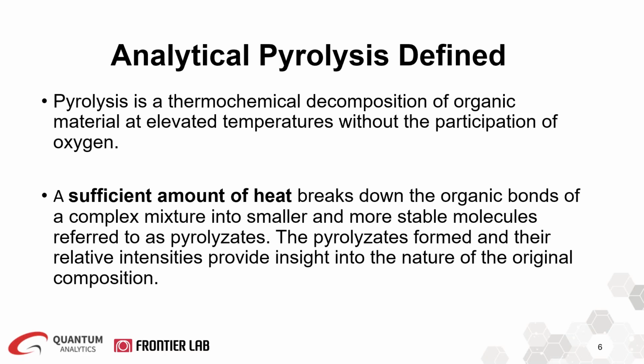It's very important to mention that applying the sufficient amount of heat and identifying the appropriate temperature to program your pyrolyzer furnace are critical factors in the pyrolysis technique. And as we go more into detail from today's slides, you'll find out how to identify that sufficient amount of heat for your sample so you're not doing over pyrolysis or under pyrolysis of your samples.